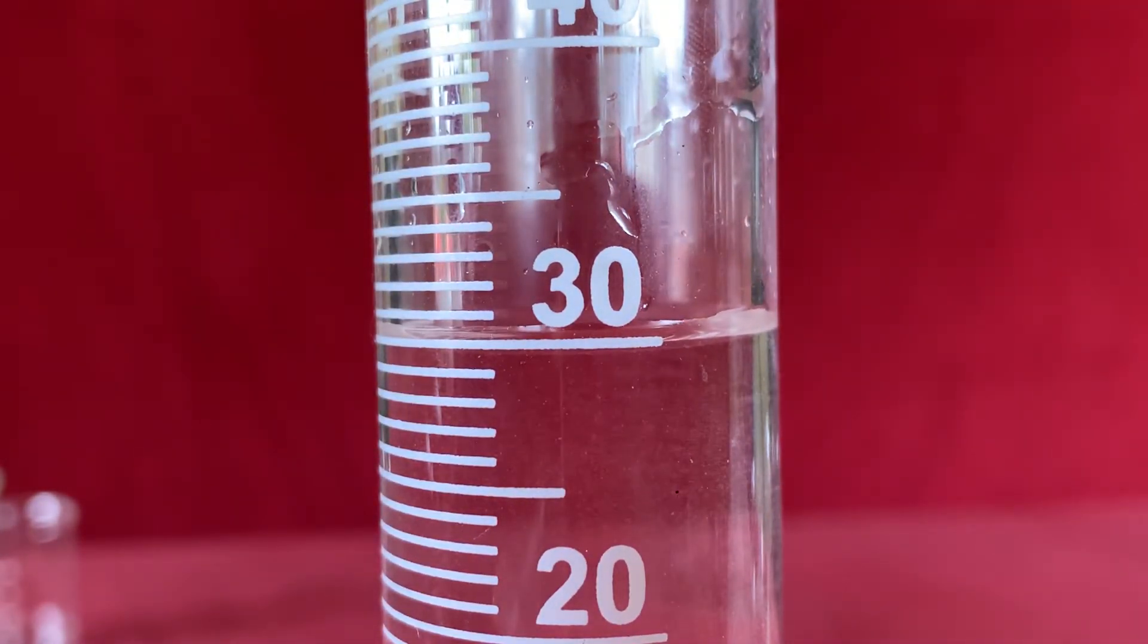You can see here the graduated cylinder gives us a much better idea of how many milliliters of water we have. The meniscus is actually a little bit below 30, even though we were well into the 30 line on the beaker. The graduated cylinder is a much more precise instrument for measuring volume.